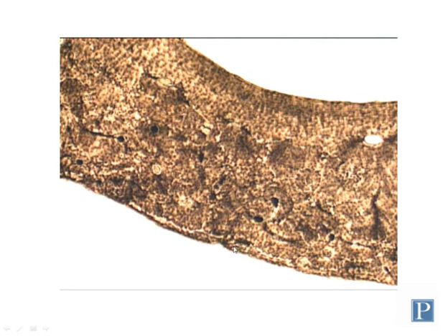Because the calcium salts and other salts are maintained in the matrix, the architecture of the matrix is preserved really well. So it's too hard to stain it. You can't stain it because the tissue is not soft enough. But it does preserve the architecture much better.